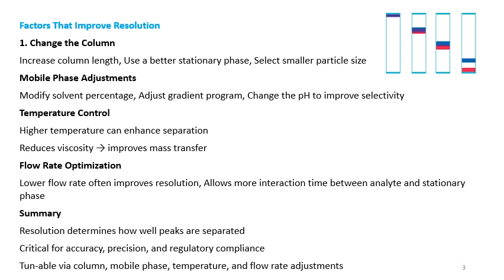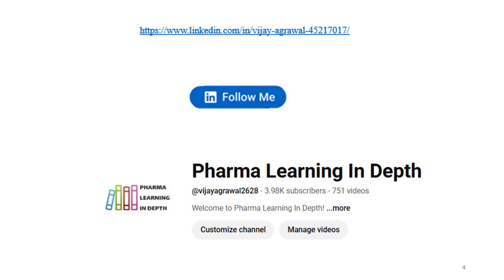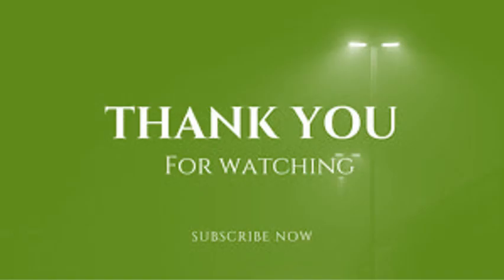And for fine tuning of the resolution, you can get the required resolution by having some changes in the column, that is the stationary phase, flow rate, temperature control and the mobile phase adjustments. You can also work on the method development and method optimization, and you can get better results through better resolution. So this is regarding the resolution term in the HPLC.